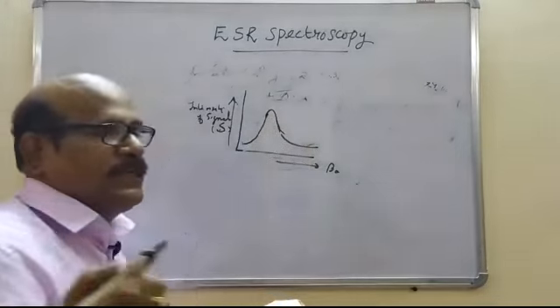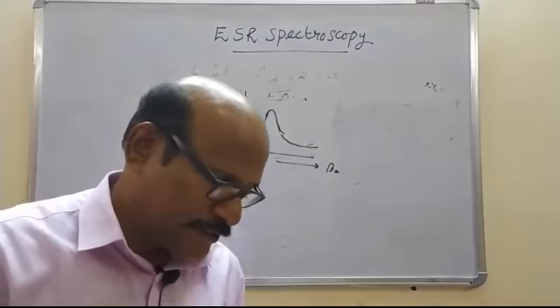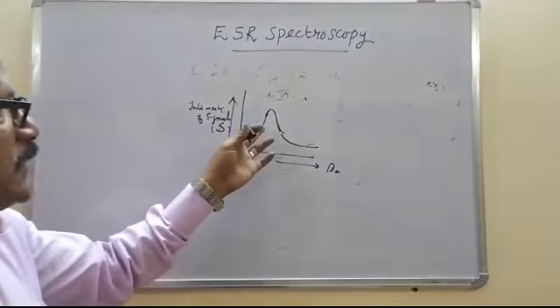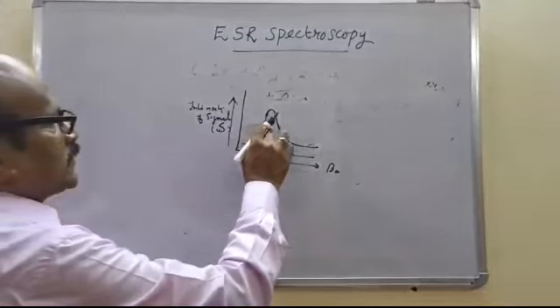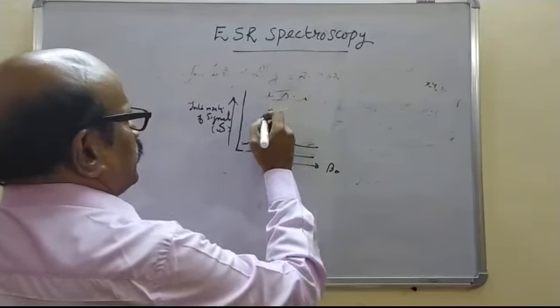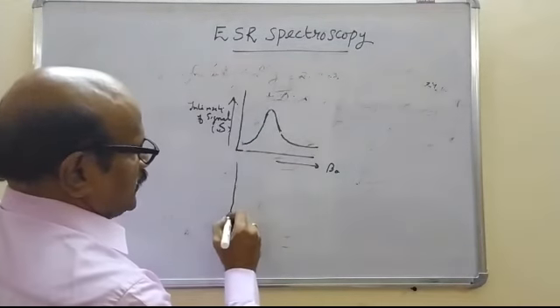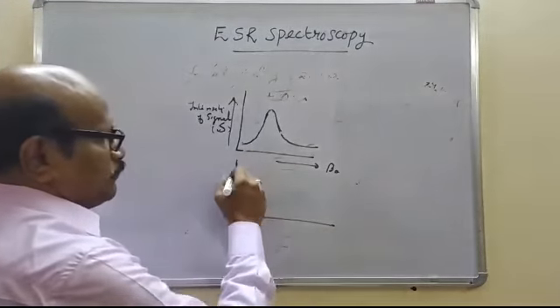The peak is usually a broad peak. That is a difficulty in analyzing this. In order to avoid confusion, since the peak is not strictly a peak but a broadened peak, it is better to modify this plot.